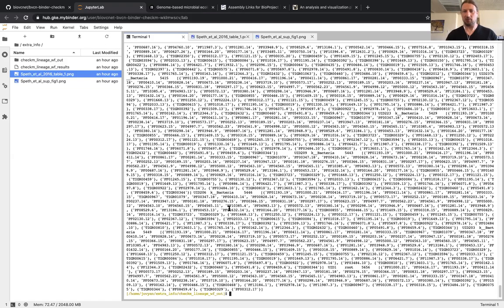In the taxonomy workflow, if you run it for yourself, the lineage.ms will not be called lineage.ms, it will be called bacteria.ms, because we've set a fixed set of marker genes for that one that corresponds to that lineage in bacteria.